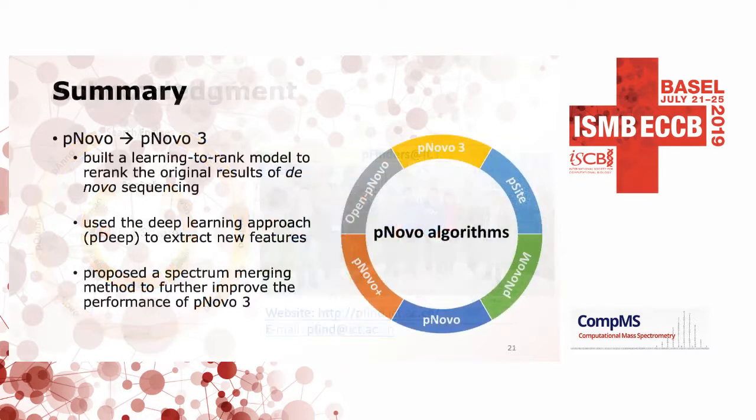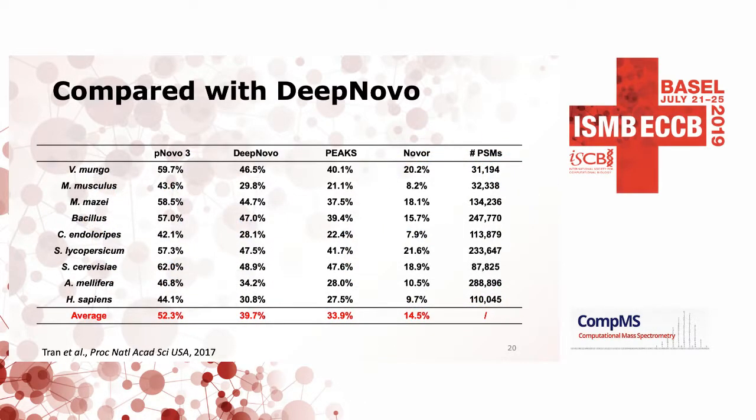And now you're reaching about 50%. Have you looked in the remaining 50% to see what are the type of errors? Are these swaps, or do you have almost all amino acids correct and they're just 2 swaps, or is it completely different? Or is it due to, I don't know, modification of the peptides?